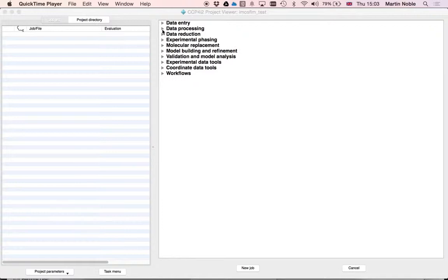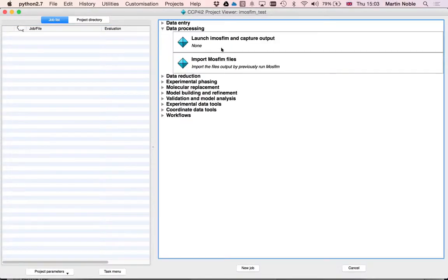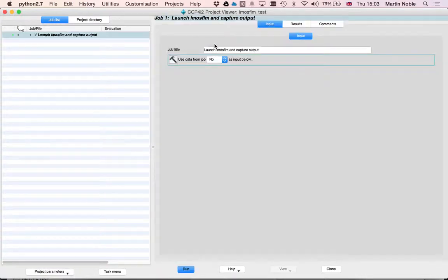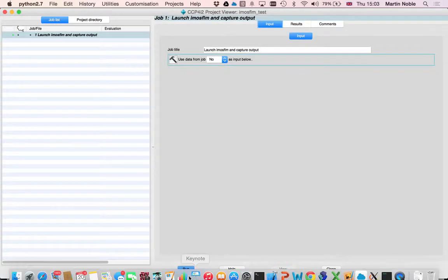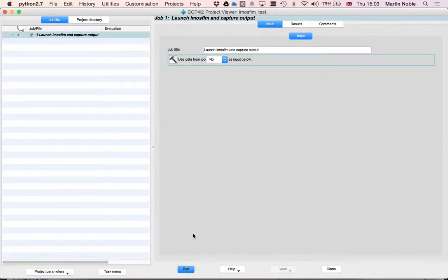We've got iMozFilm available for that. It's available in the task menu and data processing. Here we've got launch iMozFilm and capture the output. So I'm just going to click here to run that.